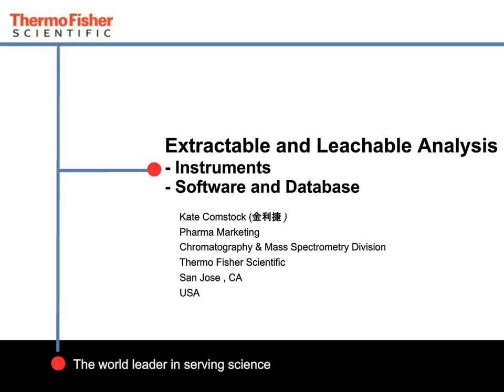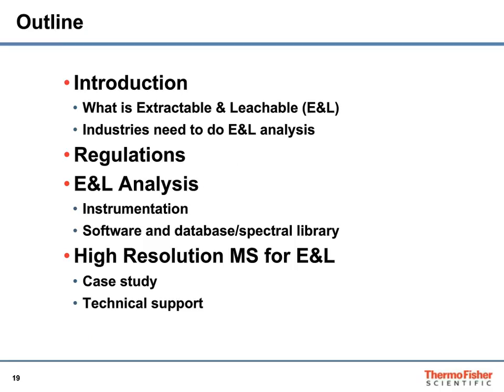Thanks for Steve's great presentation on nanoparticles. Now I'm going to talk about a more general and broad subject, which is the extractable leachable analysis, and we'll touch upon the instruments, software, and the database. Here is a brief outline. What is extractable leachable?